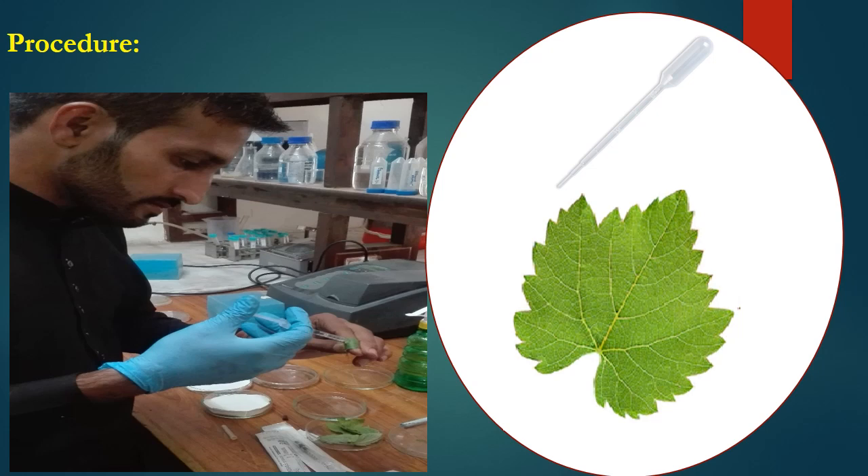Here is a student performing the leaf detach method to screen tomato varieties against a bacterial pathogen. If you look closely, he is injecting the bacterial inoculum into the tomato leaves. It is always advisable to use more than 5 leaves per treatment so that results remain statistically viable. You can also notice the petri dishes on which filter paper is placed not only at the base but also at the lid, so that when the filter papers are moist, a humid chamber is created.